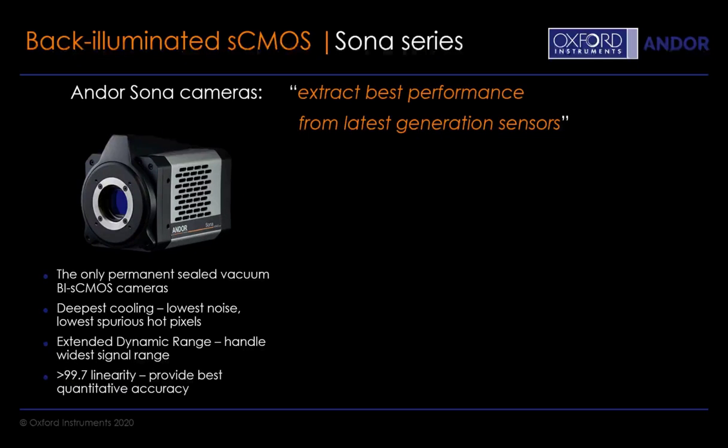With these cameras having a higher dark current, it's very important to suppress that dark current from being an issue, and also importantly reducing the amount of spurious hot pixels as well. For the kinds of studies that have just been presented, we can see that it's very important to reduce any of these spurious events from affecting our data.